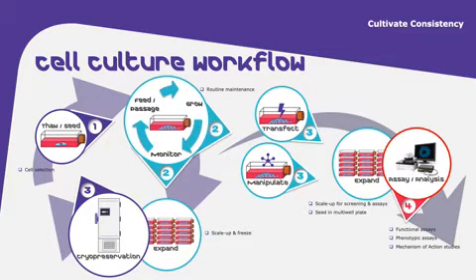This is where researchers will spend a lot of time feeding the cells and monitoring certain parameters such as confluency, the pH of the media, morphology, cell density, and many other factors. You also have an opportunity here to subculture or passage the cells when they have grown and expanded. You may split off part of your cell culture and expand it for experimental purposes.